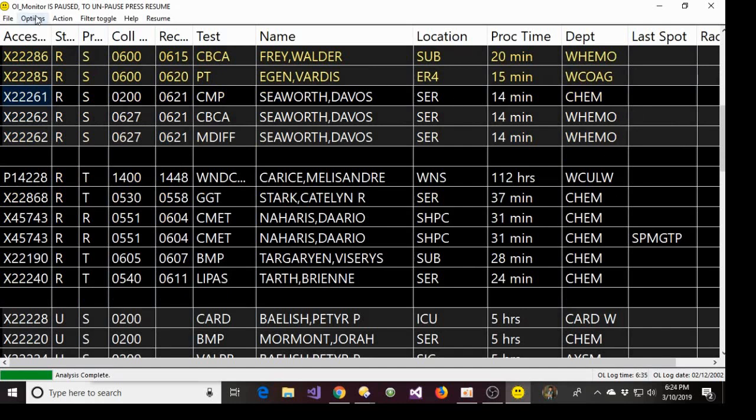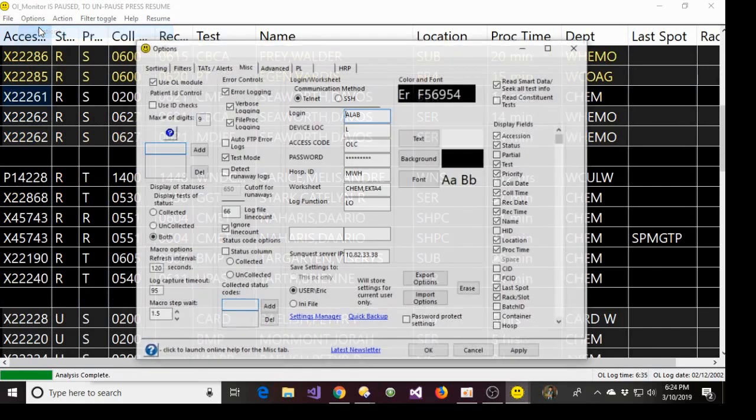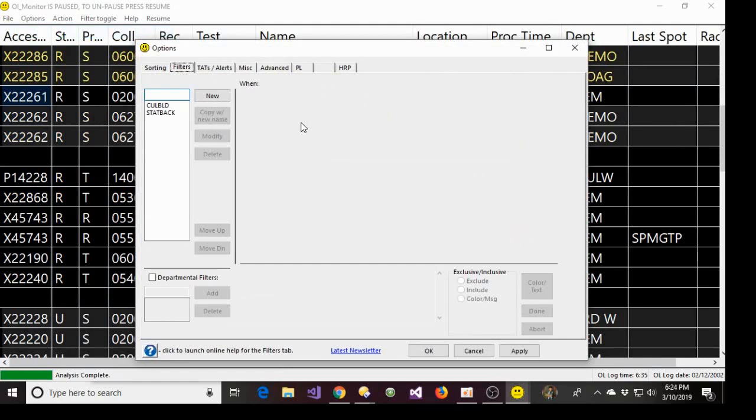But yeah, the difference is subtle, but techs are pretty observant. They'll pick up on that. You don't want to make your colors too jarring, although sometimes it helps to go ahead and do that to bring attention to stuff.